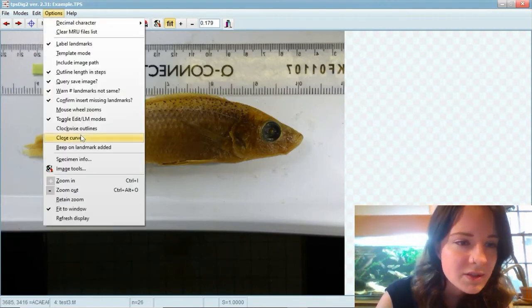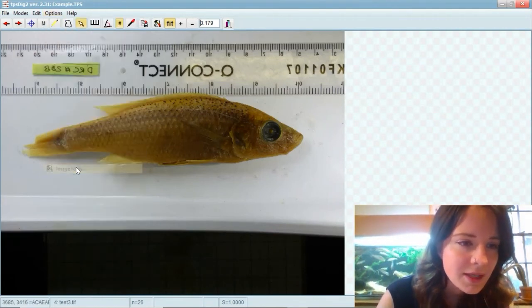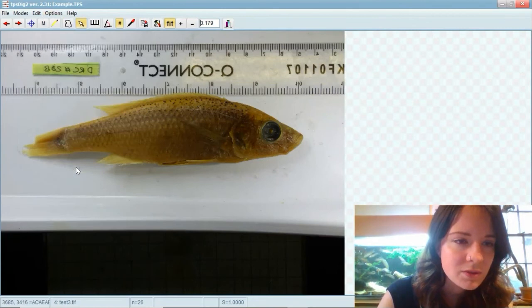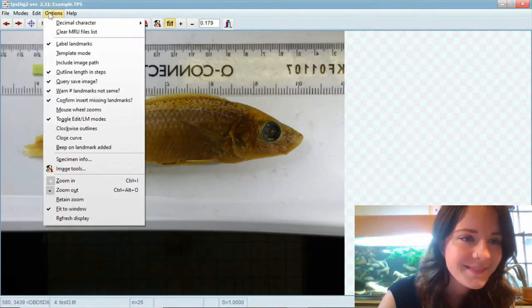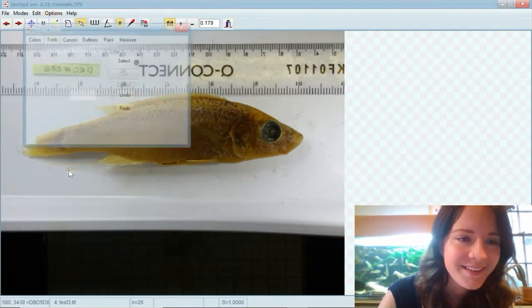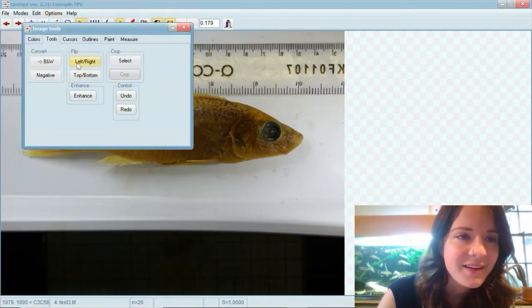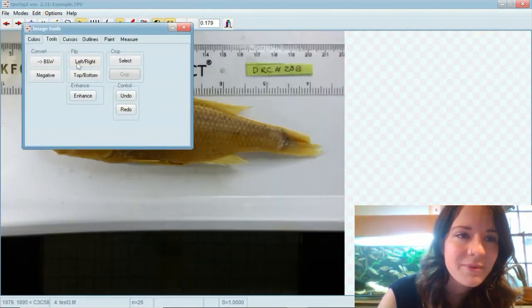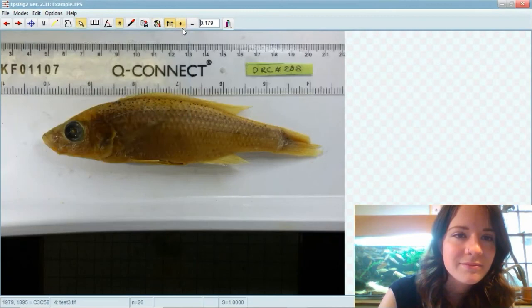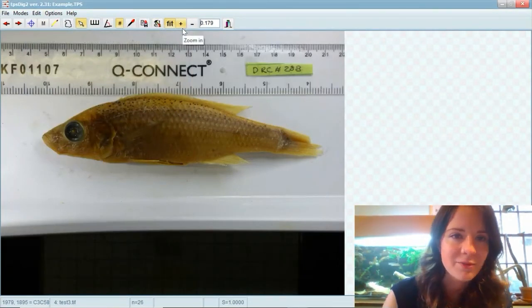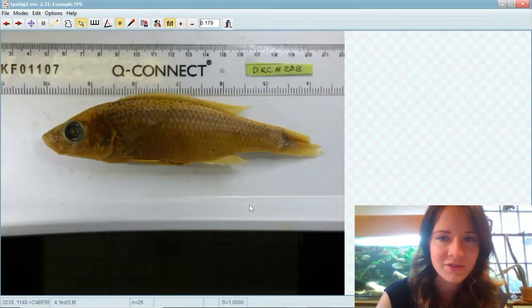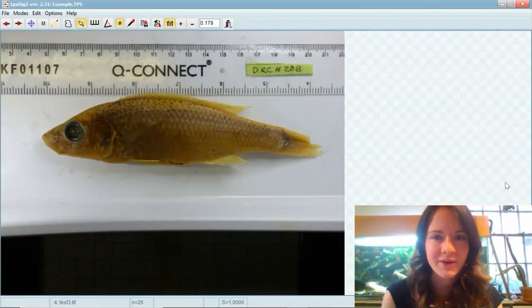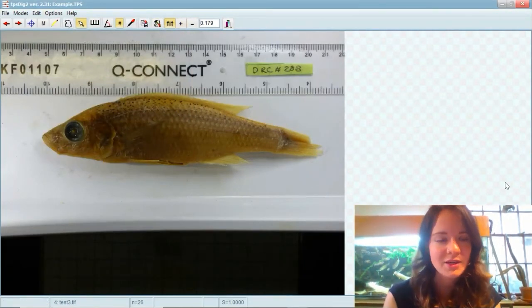Image tools, and then flip left to right and there you go. And it's got the same orientation as all the others, so quite an easy fix there.